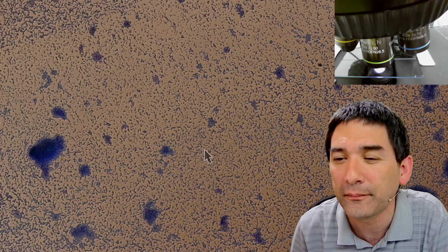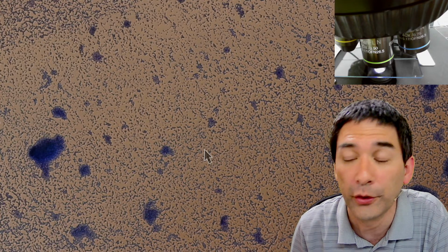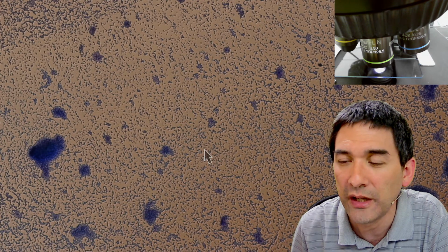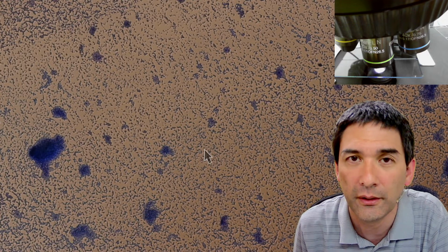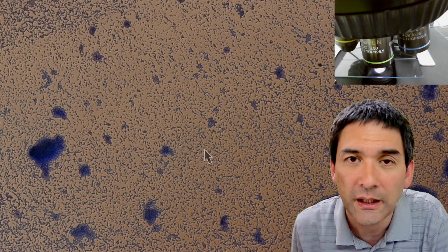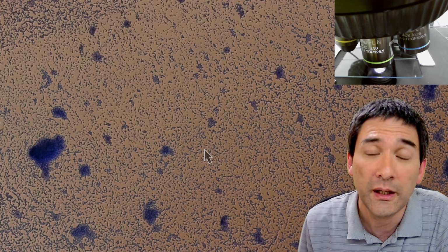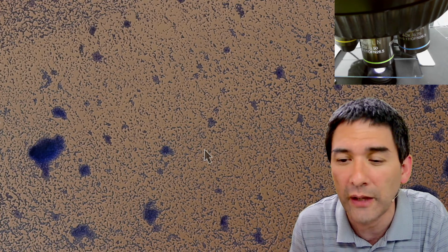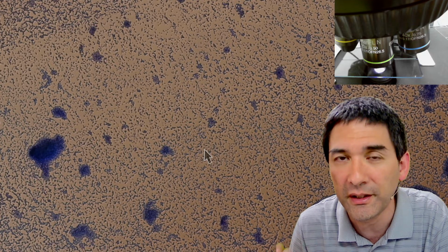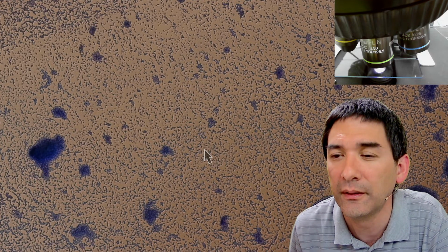What about mouth bacteria? Oh, there are plenty of them. All you do is take a saliva sample and put it under the microscope. You're able to see them. However, sometimes there's so much other stuff there that it might be a little bit difficult to actually distinguish what are bacteria and what are your own cells.